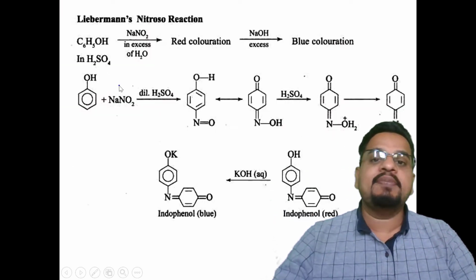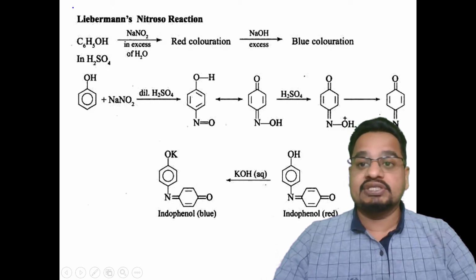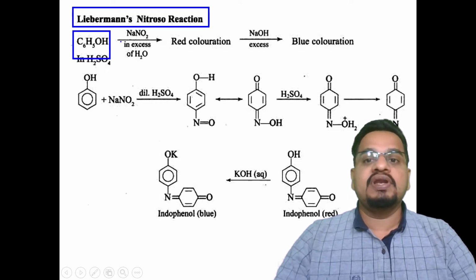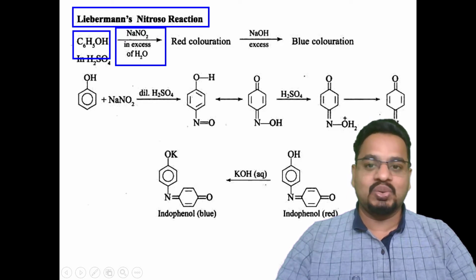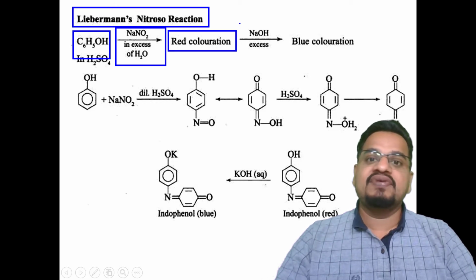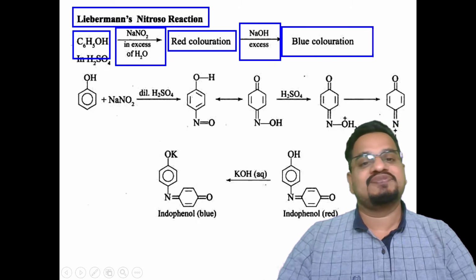Understand? Now the second important test is the Liebermann nitroso reaction. Many a time this reaction is asked in the examination. So this is the phenol. Phenol, when reacted with sodium nitrite NaNO2, gives a red coloration, and with excess of sodium hydroxide, a blue coloration is formed.